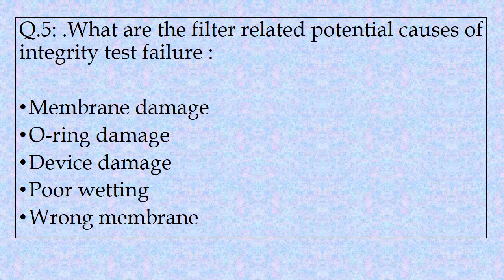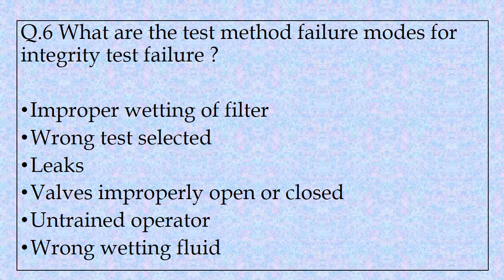Question 5: What are the filter-related potential causes of integrity test failure? Causes include: membrane damage, O-ring damage, device damage, poor wetting, wrong membrane, wrong test selected, leaks, valves improperly open or closed, untrained operator, and wrong wetting fluid used for integrity testing.